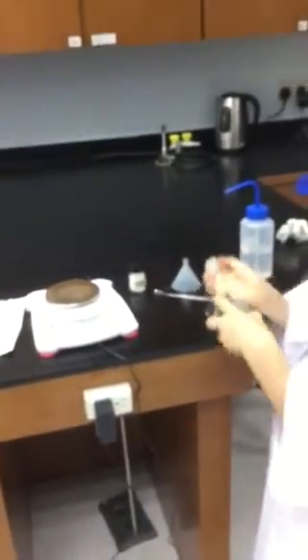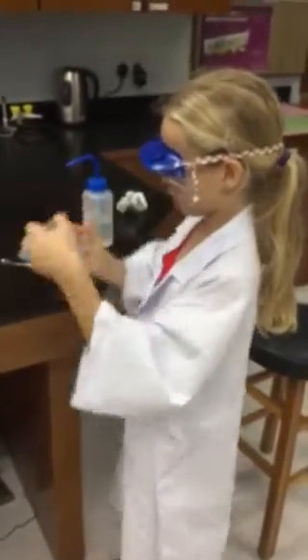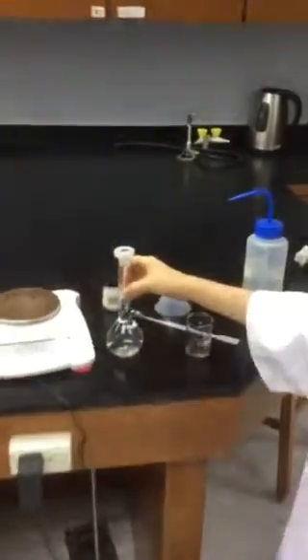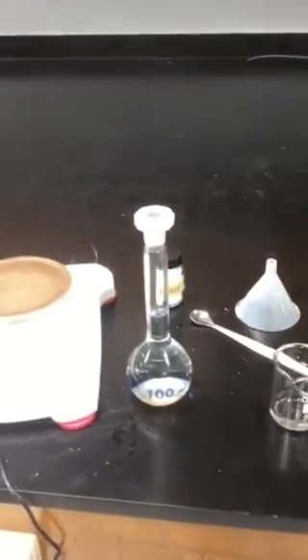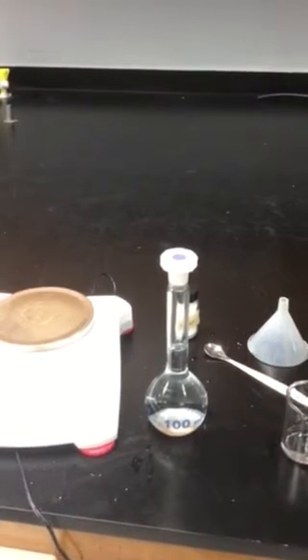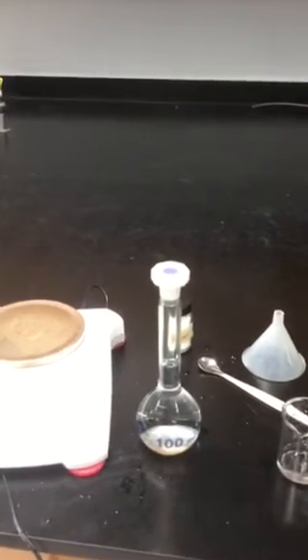1, 2, 3, 4, 5. Okay, and sit that down. And there we have a solution of sodium chloride with a precisely known concentration. We know the mass in grams precisely as 1.55 grams, and we know the volume of the solution as 100 cc's or 100 milliliters. We can now go away and calculate the molarity, the number of moles per decimeter cubed or per liter of our salt solution we can use for any subsequent experiments.